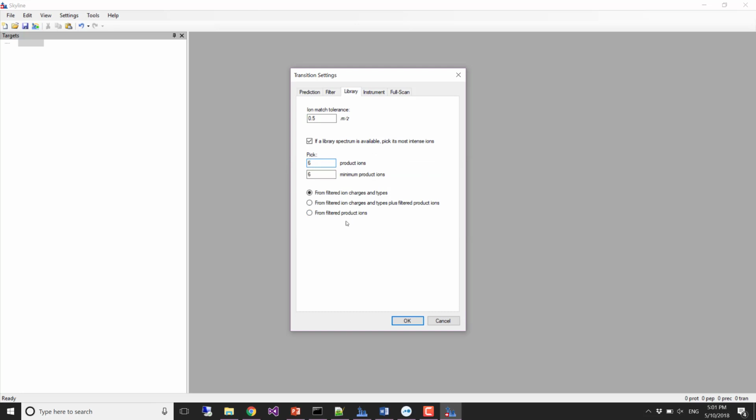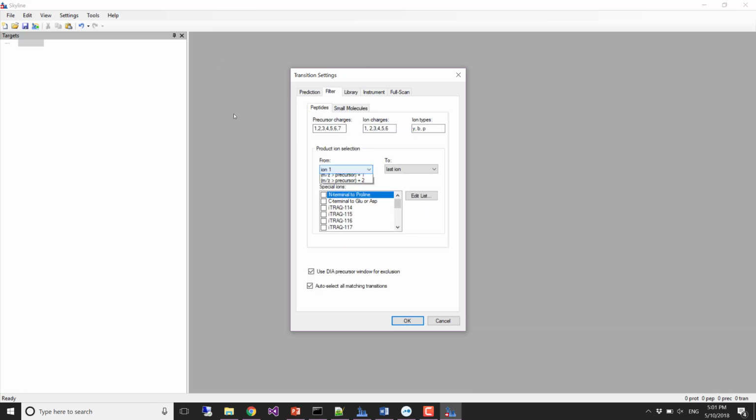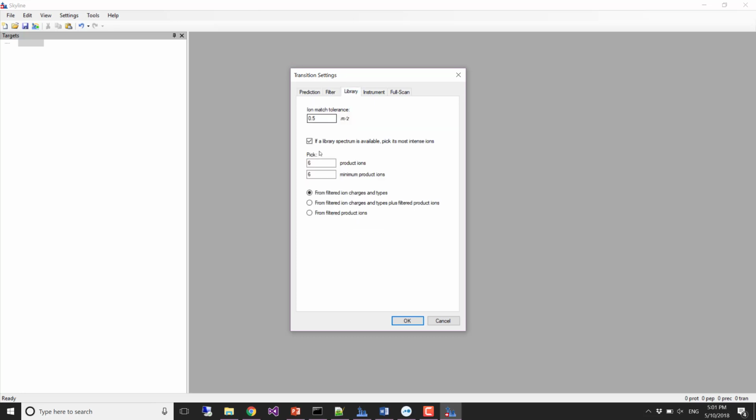I don't quite understand that. Did anybody else get that? Okay, so there's some kind of bug when you switch a value. I think when I'm switching these values, it somehow sets the default back to 3. So now we ought to be able to go done. Everybody got those settings?